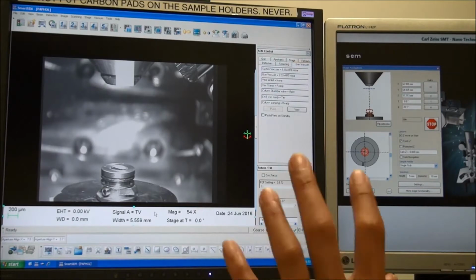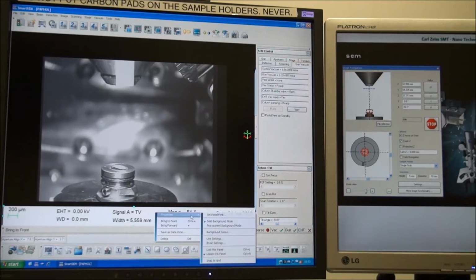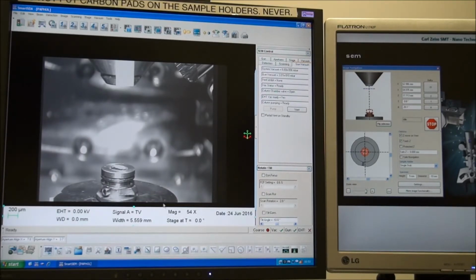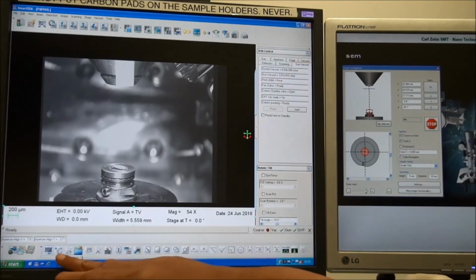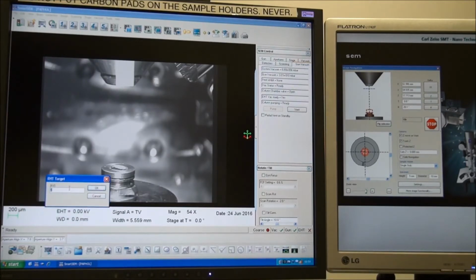And after we're done editing the Datazone, you also have to lock the panel again here by right click, Properties, lock this panel, and then remember to go back to EM mouse control over here, because this function allows you to double click on the parameters at the Datazone and change the parameters here.